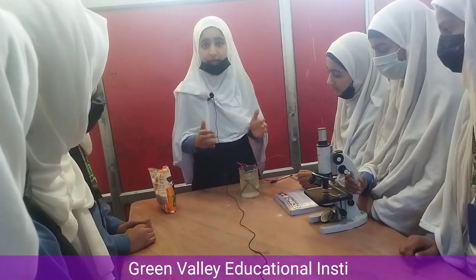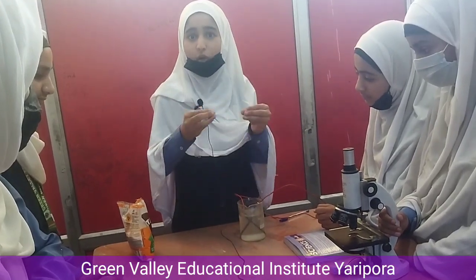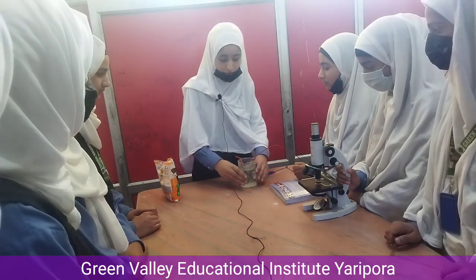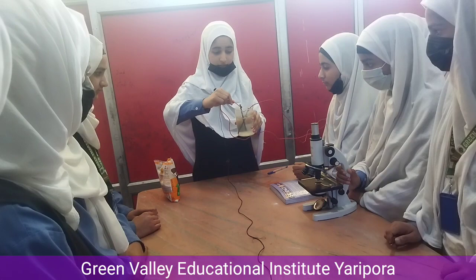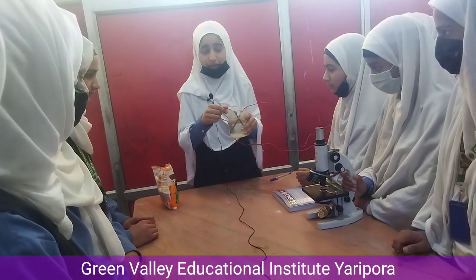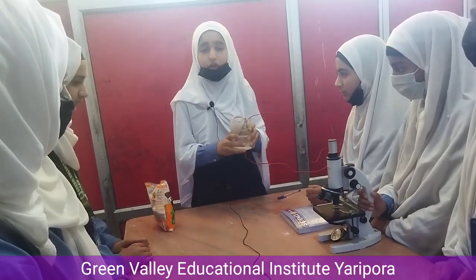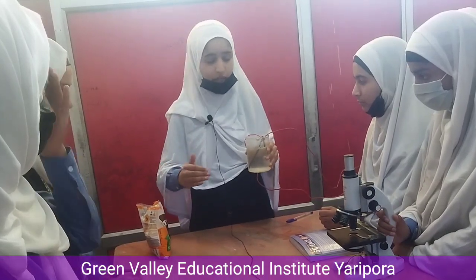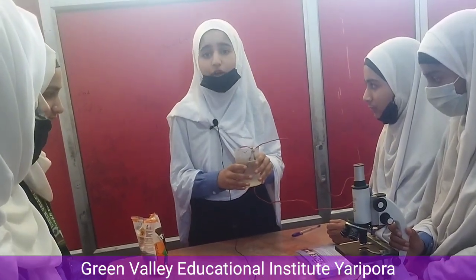We can also say that when we pass an electric current through sodium chloride solution, the sodium chloride solution breaks into sodium and chlorine gas. Both sodium and chlorine gas move towards the opposite charge of their own. I forgot to tell you in the beginning of this video, really sorry for that, but let me explain now. Electrodes are also of 2 types, anode and cathode. Anode is the positively charged electrode and cathode is the negatively charged electrode, or we can say anode is connected to the positive terminal of the battery and this cathode is connected to the negative terminal of the battery.